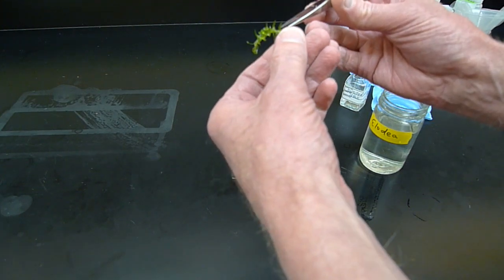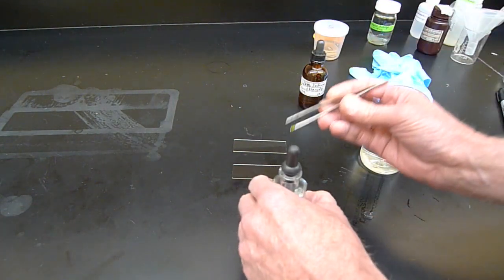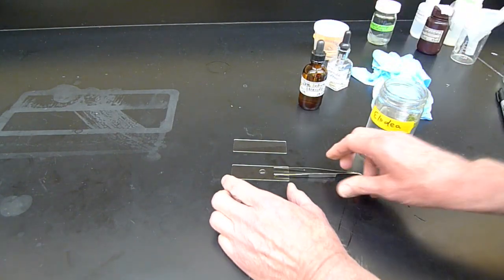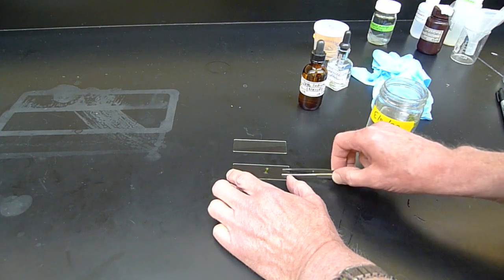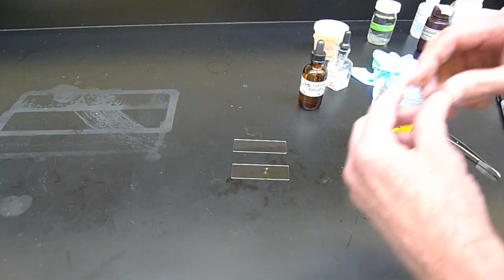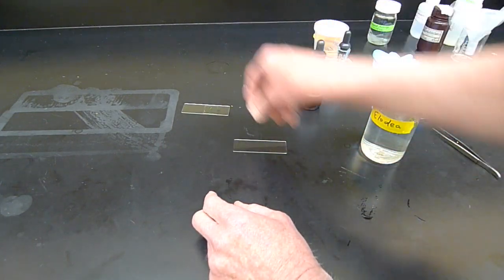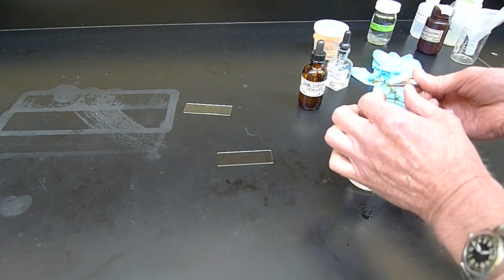So I'm just going to rip off one of these little leaves of elodea and put it in one case in a drop of water. See if I can get this to lie flat. And put a cover slip on it. And then the same thing on this slide. Take a piece of elodea, little leaf.